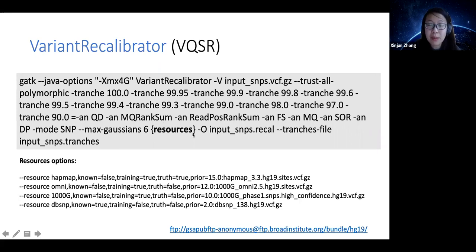What you do need to worry about is first, your input, and second, what you want to name your output recalibration table. And most importantly, we need to specify the training data for the machine learning, which is the list of known sites. This part of the code will be very long, so I shortened it.